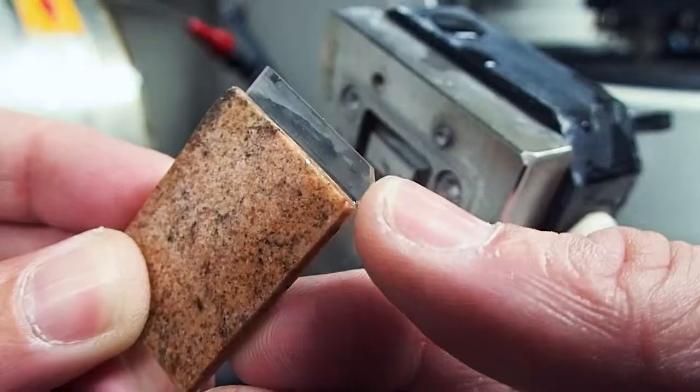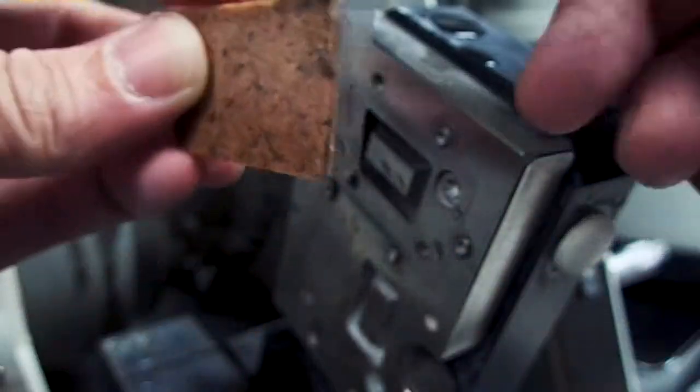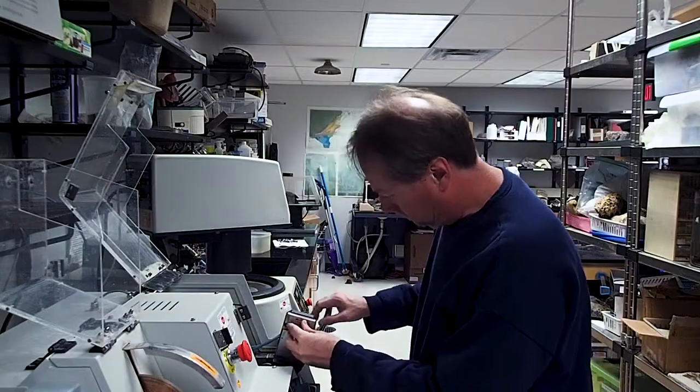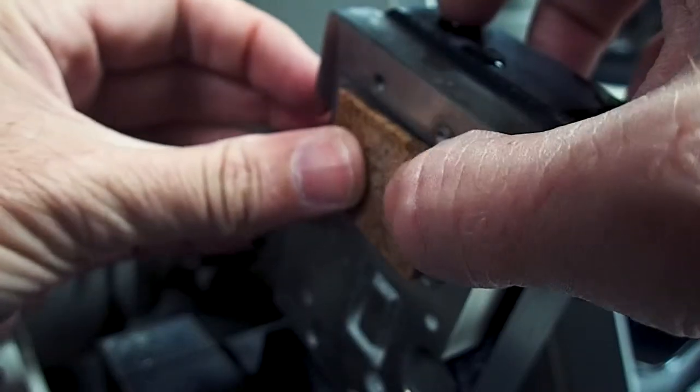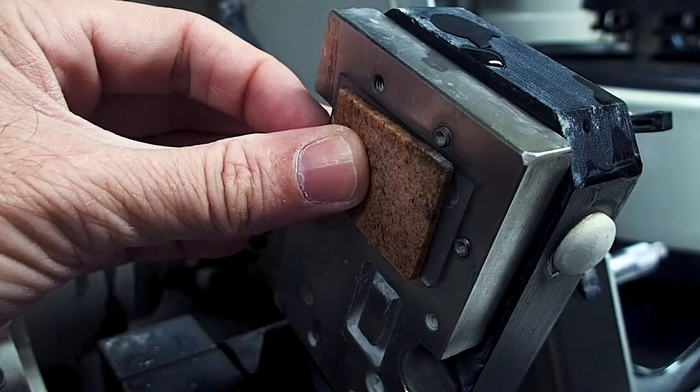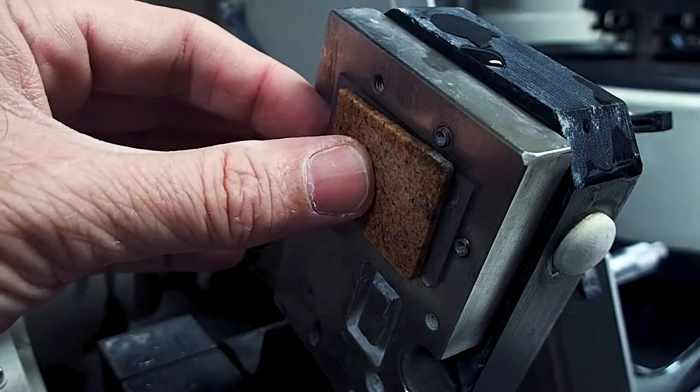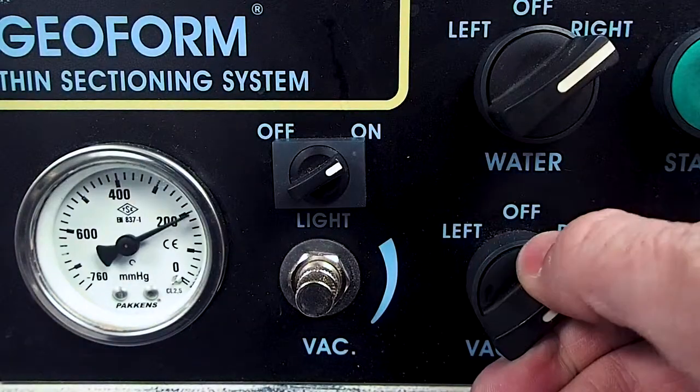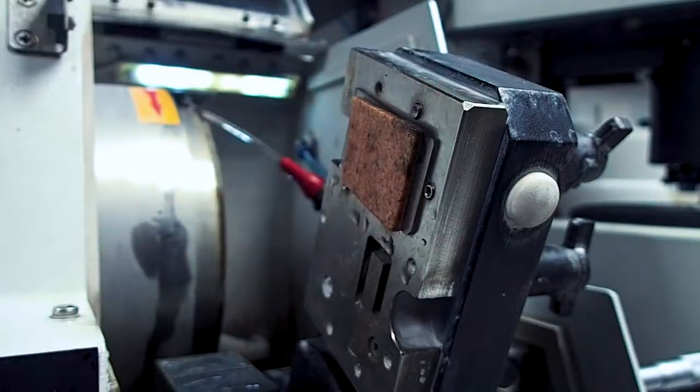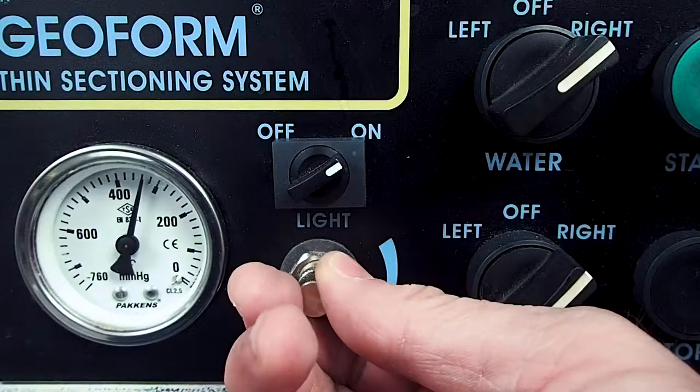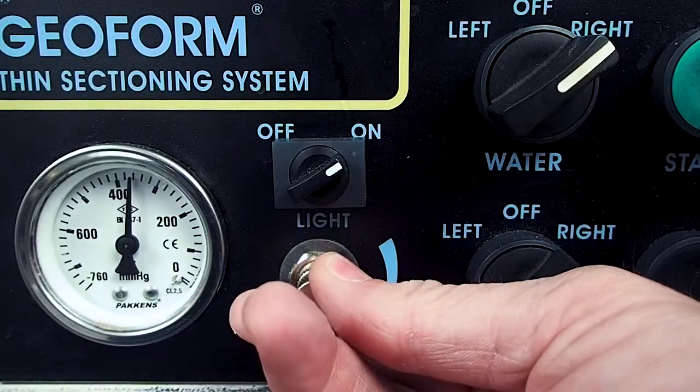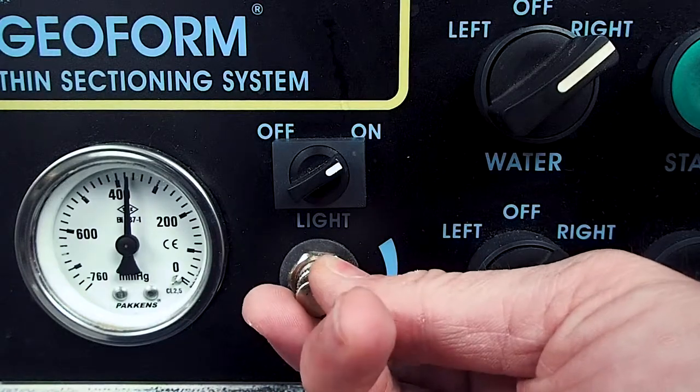Use the beveled off corner to orient the slide on the vacuum chuck in the same position that was used when the slide was frosted. This helps ensure that the rock will be ground away from the slide evenly and parallel to the surface of the glass slide. When the slide is in position, go ahead and turn on the vacuum. Before proceeding, make sure there is enough pressure to hold the sample chip securely on the vacuum chuck and adjust if necessary.